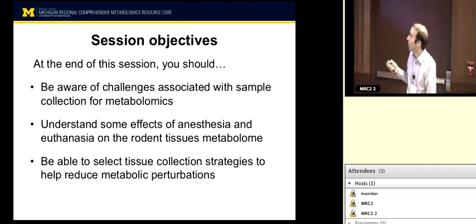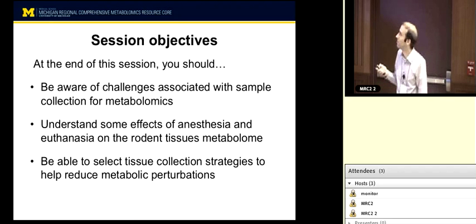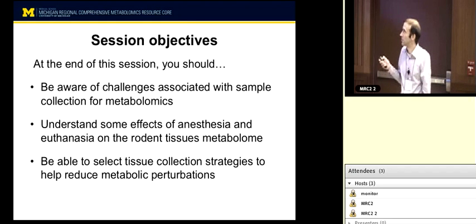The choice of anticoagulant, we've had decent success with both EDTA and heparin, and citrate not as good. I forget if Kelly mentioned that earlier today. But generally, that's well studied in the literature. You can read about that.